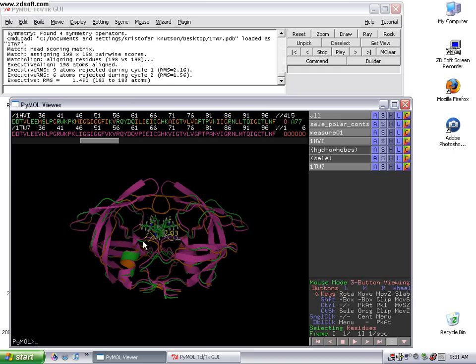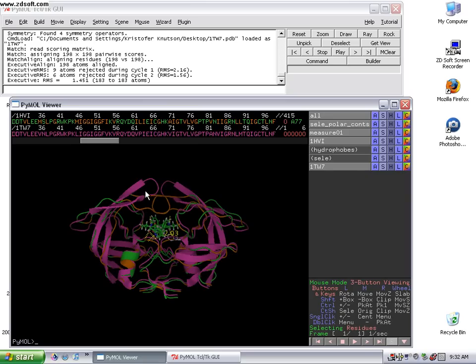I was talking about the orange HIV protease structure being an inhibitor-bound structure, whereas the purple structure, the purple PDB, is an open structure. So you can definitely see the difference in the flap region here.